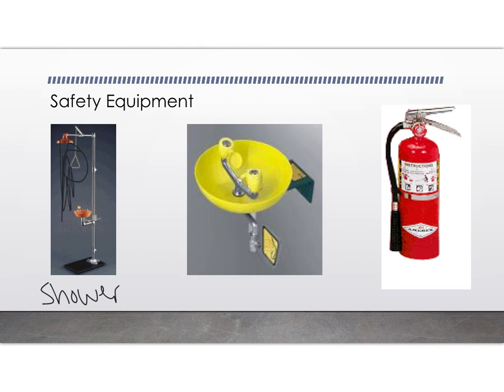If you get something in your eye, we have an eye wash station for that. They are located on the sinks inside the classroom in one specific area, and there's also one or two in the laboratory, and I'll identify those specific locations whenever we get in there. If you get something in your eye, you'll turn on the eye wash station. Water will shoot up from the top, and then you will have your eye over the eye wash, and you're going to flush it out for about 10 to 15 minutes just to make sure you get everything out.